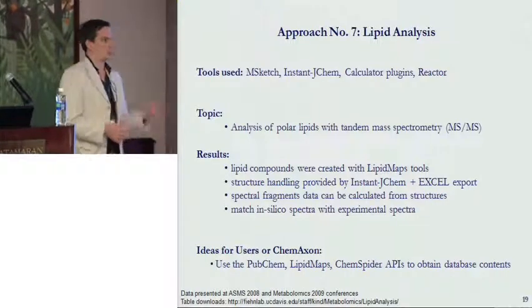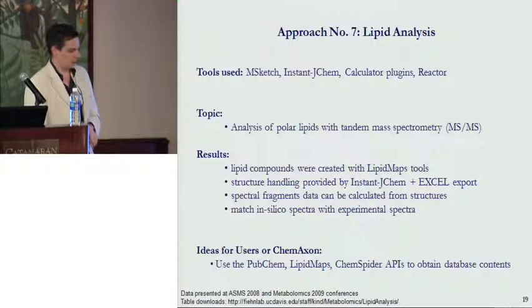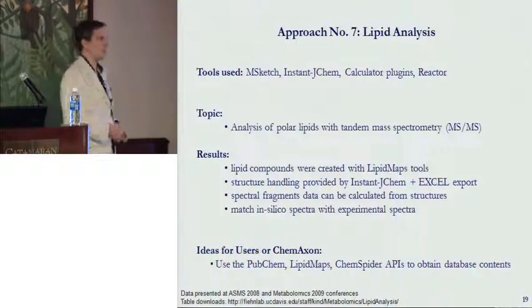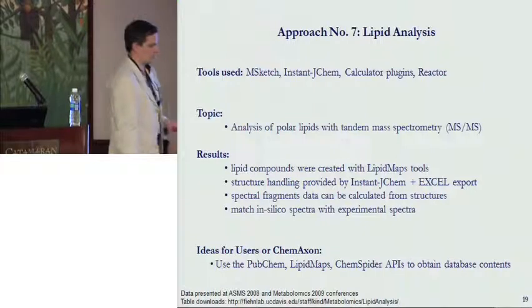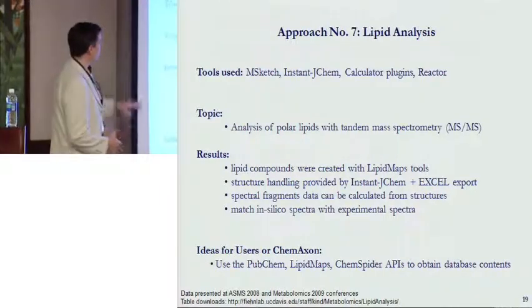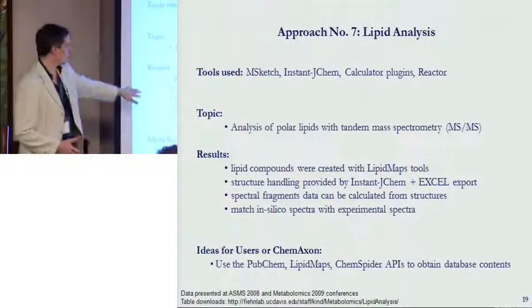And you may know that the Craig Venter Institute here in San Diego, or around San Diego, is also heavily investing in lipid analysis for biofuel research. So there are lots of facilities involved in that. One point is not only to grow microbes or algae, but also to analyze what kind of lipids are in there. And we can do that very well with mass spectrometry, or LCMS and GCMS.